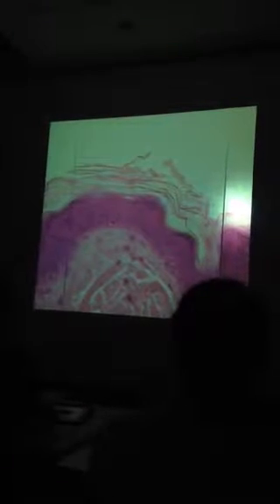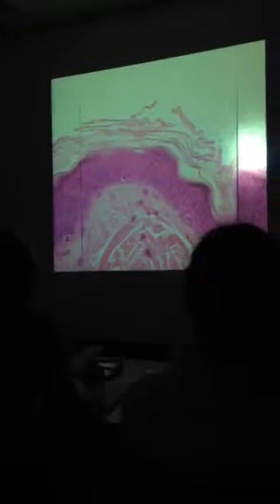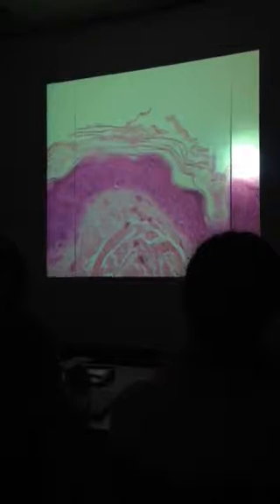Keratinized, stratified squamous. And what's this a slide of? The epidermis of what? Thin skin. Obviously, there's not a lot of corneum there, is there? It's obviously thin skin. If you don't put thin skin, you're not going to get full credit. You see the difference between thin skin and thick skin? Do I have to go back and show you thick skin, or you got a mental image? Okay?